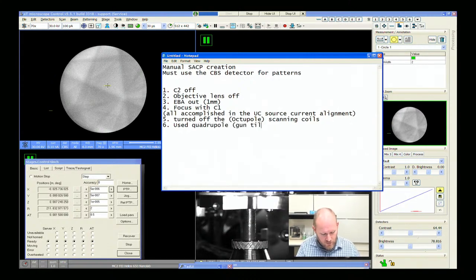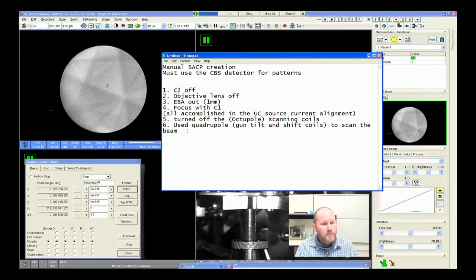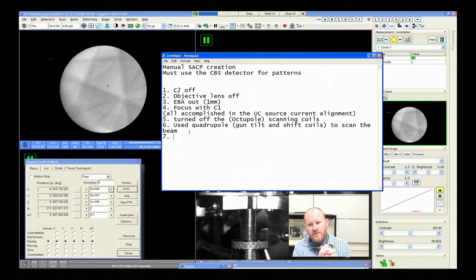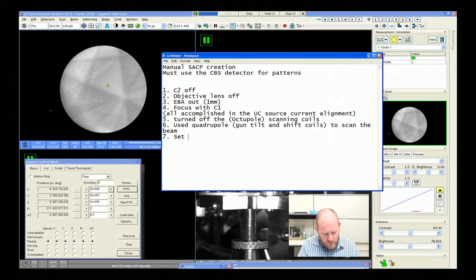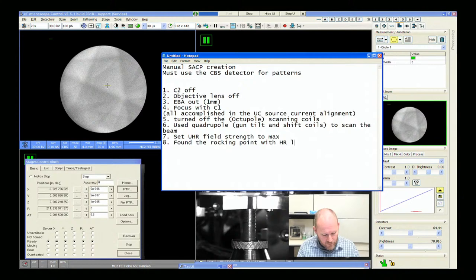We used the quadrupole — which is traditionally the gun tilt and shift coils — to scan the beam. And then at this point, what we wanted to do was create an objective lens field. In our case, we use a compound lens effect with the UHR lens and the HR lens. Set UHR field strength to max. And we found the pivot point — sometimes I call it the rocking point — with the HR lens. At that point we're now creating SACPs.